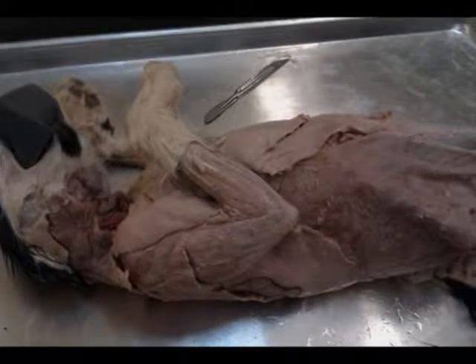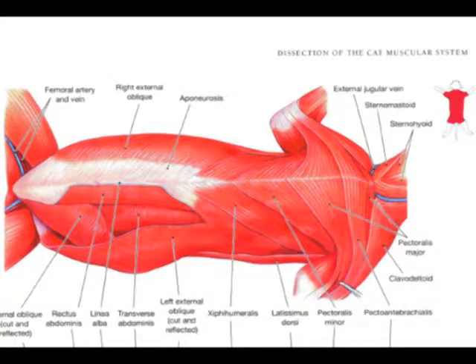The cat has a similar anatomy and physiology to a human. It has organs that perform the same function as a human. From muscles to the cardiovascular system, we will go over the anatomy and relate it to that of a human's. Muscles are used to pull and contract. They are used for mobility and to help with functions of certain organs like the heart.